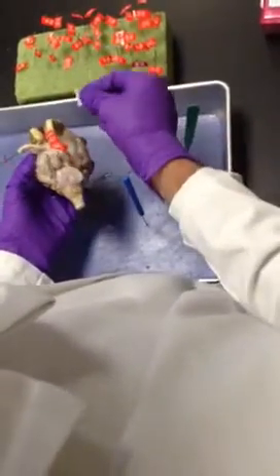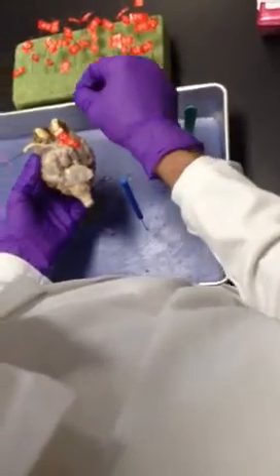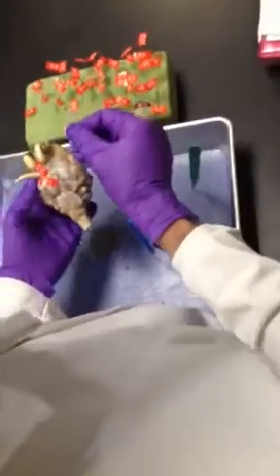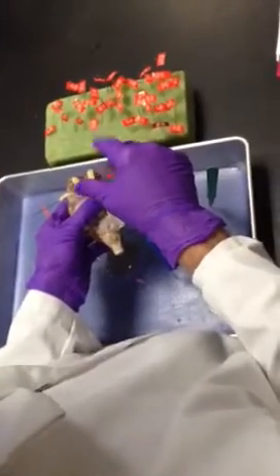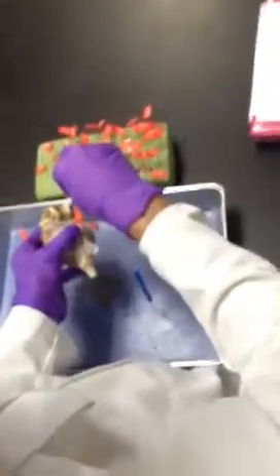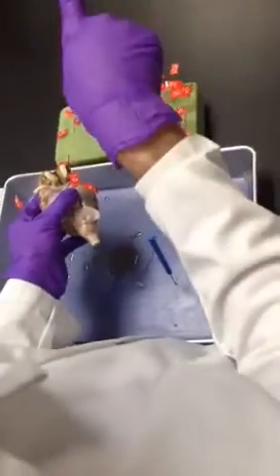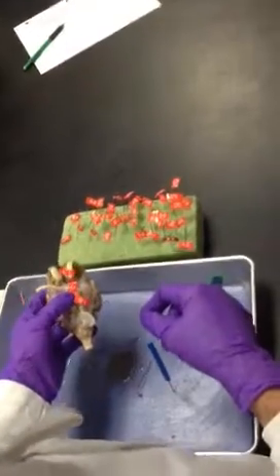So what we have here is our olfactory bulb. And see, it's fairly wide, and then it's hard to tell by color, but on yours you'll be able to see it's going to taper down, it'll look a little darker, and then that's the olfactory tract down here. And the tract's going to be a consistent diameter. It's just those myelinated axons on the way to the olfactory cortex.